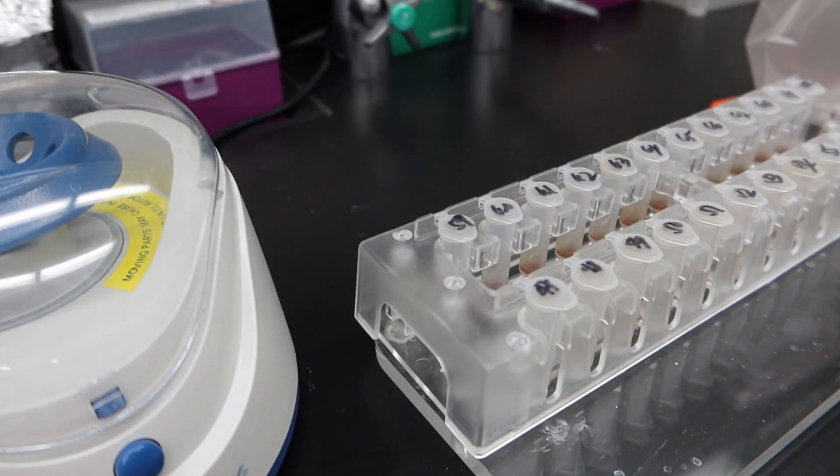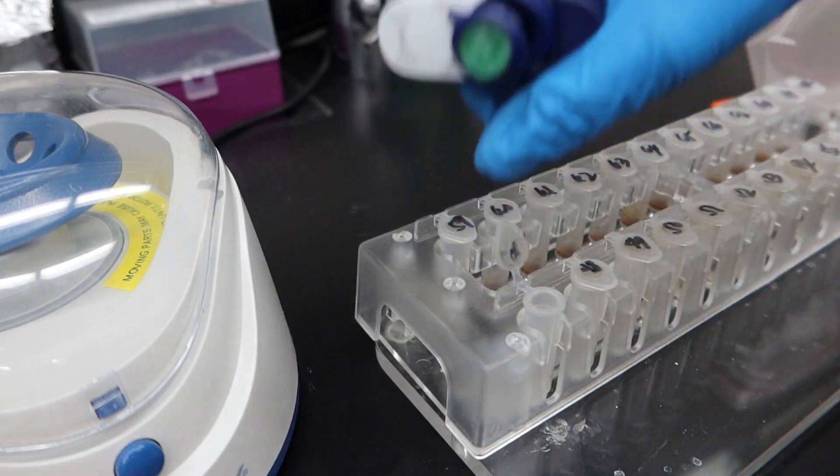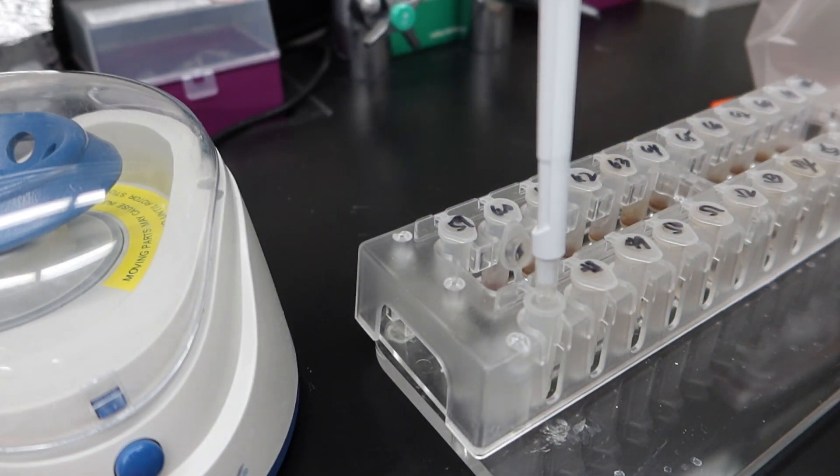Sa pinaka-last step, after ilagay yung last na buffer, which is nakaka-separate siya ng DNA doon sa magnetic bead — itong clear solution, ito na yung DNA. Andito na yung DNA.